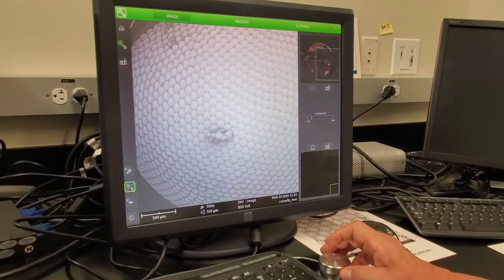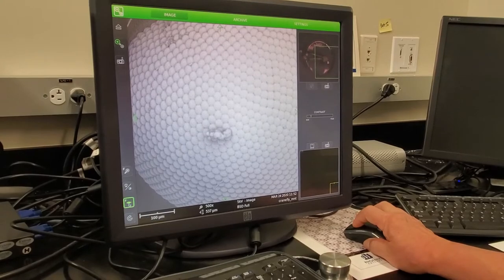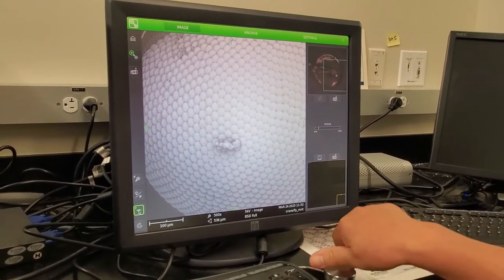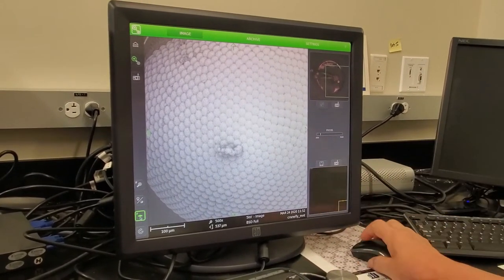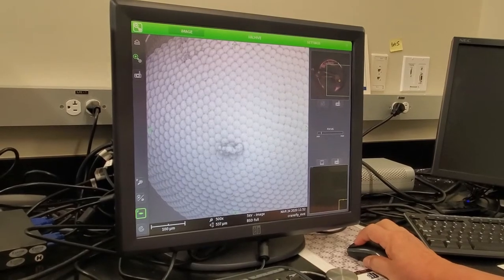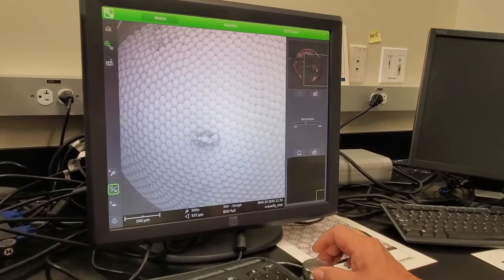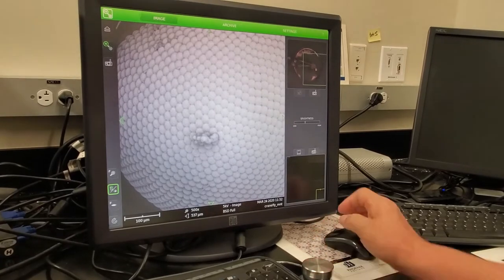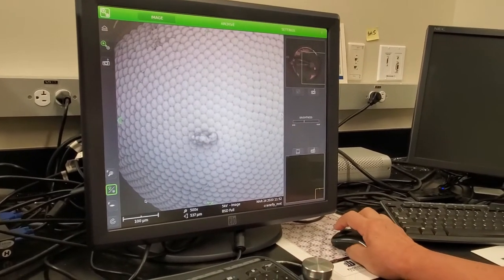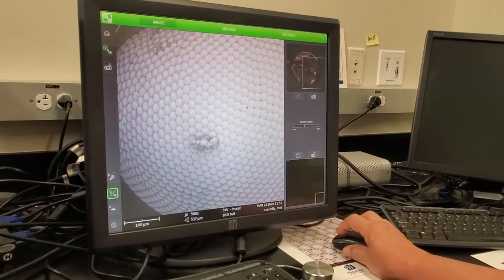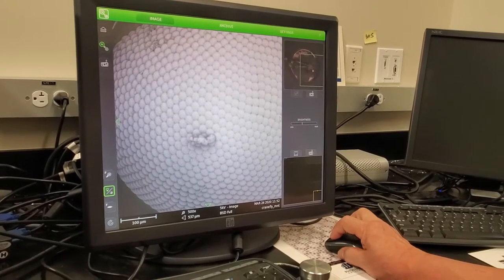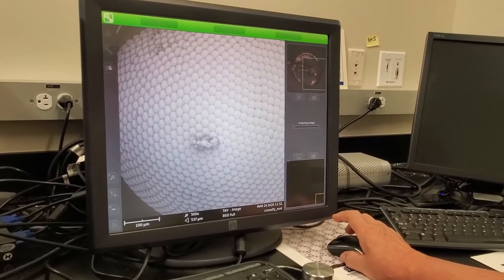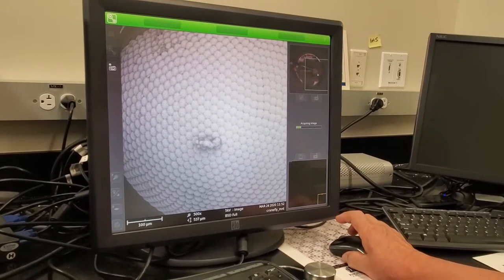I'm going to concentrate on it and bring up the contrast just a little bit. That's a little bit too bright. Here we go — focus. That looks pretty good. What you may want to do is make it a little bit darker so you can see better. So there it is — that's 500x. Let's take a picture. Remember it's stacking, so the image will look much more clear once we do that.